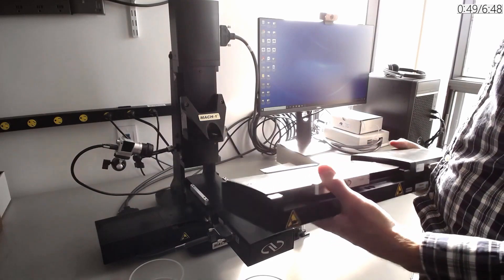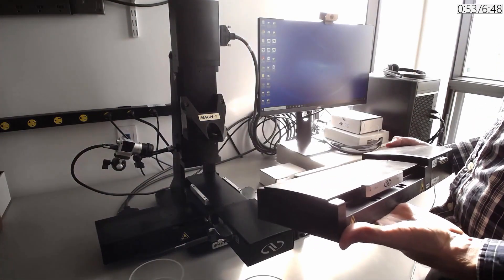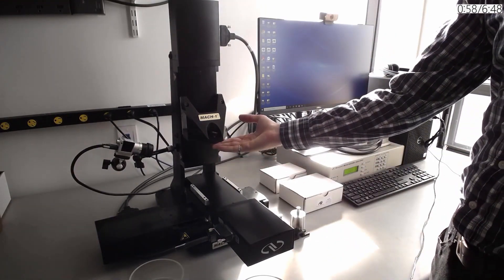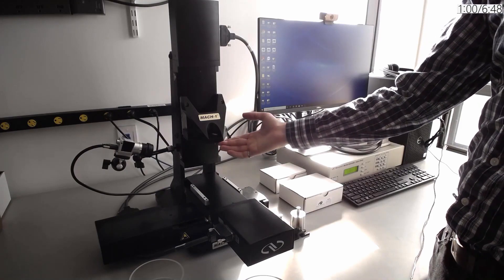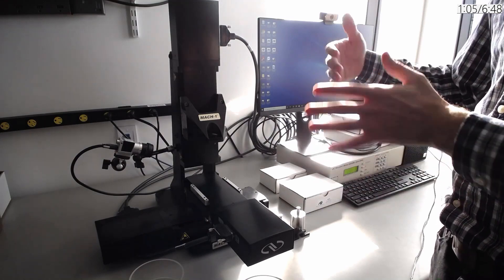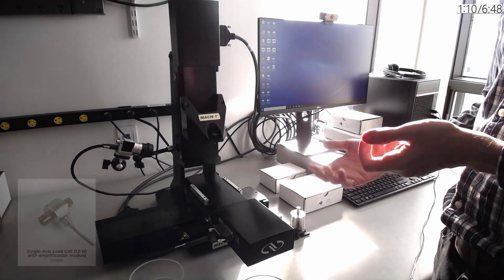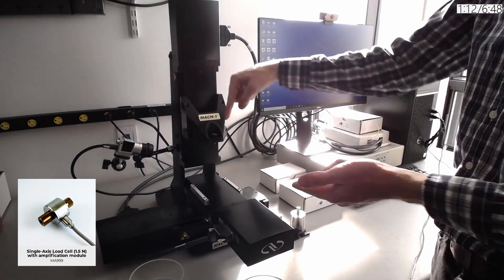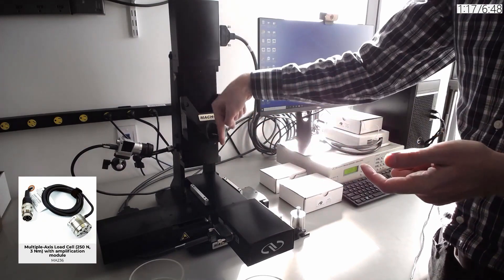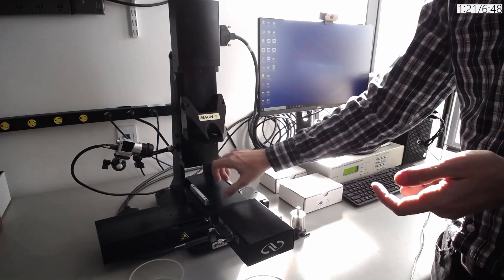These are all motorized linear stages that can be added on at a later time when you want to upgrade the system to have more capabilities such as adding shear or normal indentation. There are many different load cells that can be used on the system and hot swapped. The ranges go from 0.1 Newton max load for very soft samples to 250 Newton max load for testing harder samples such as bone. These come in both single axis for measuring only in the vertical direction and we also have multi-axis to measure both the vertical direction and both horizontal directions, and then the torques in all of those directions.